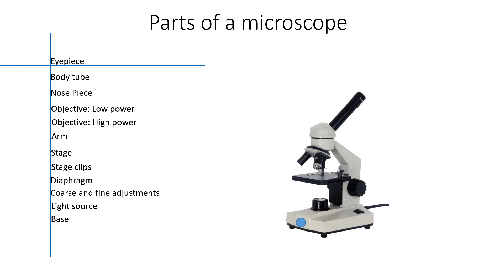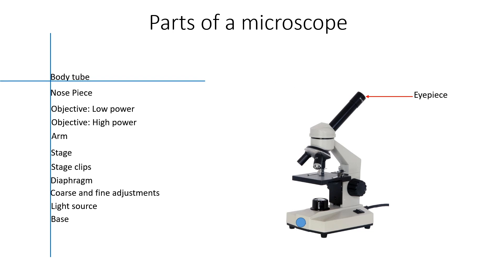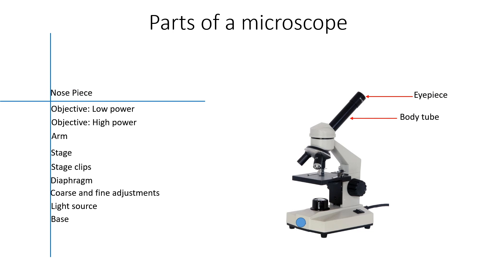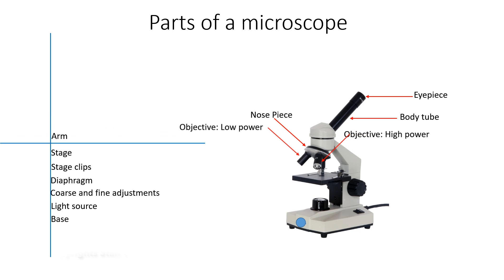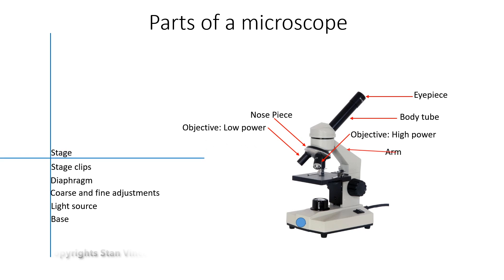These are the parts of the microscope. The eyepiece, body tube, nose piece, the objective lenses — the low power and the high power. The arm of the microscope — this is where you hold the microscope with your hand if you are moving it around.